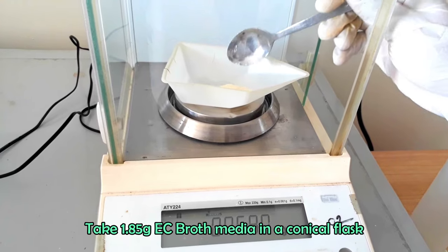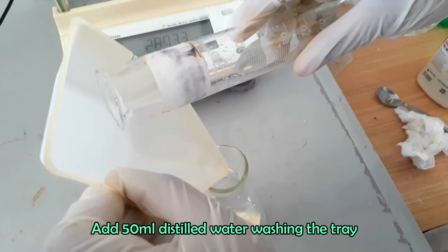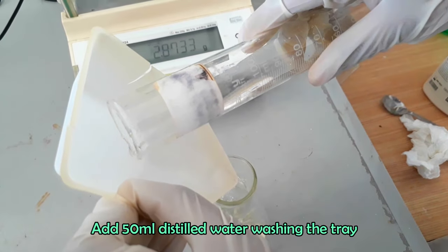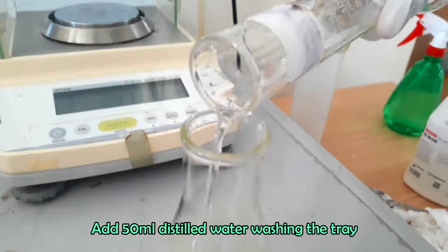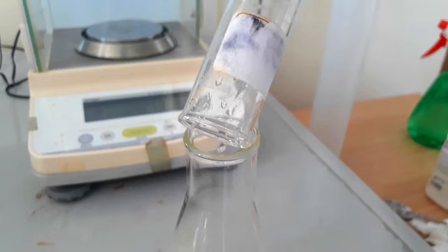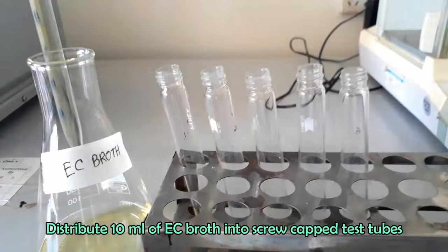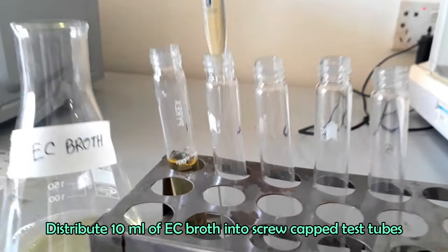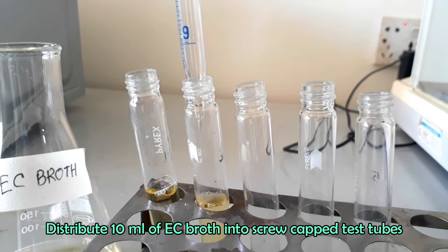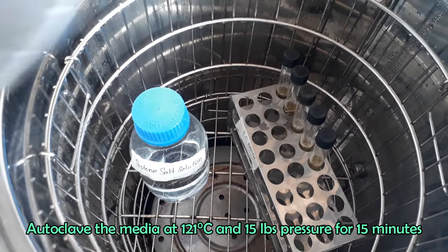For the preparation of EC broth, dissolve 1.85 grams of dehydrated media into 50 ml distilled water. Shake to dissolve the medium completely. Now transfer 10 ml to screw capped test tubes. Autoclave the medium at 121 degrees Celsius and 15 pounds pressure for 15 minutes.